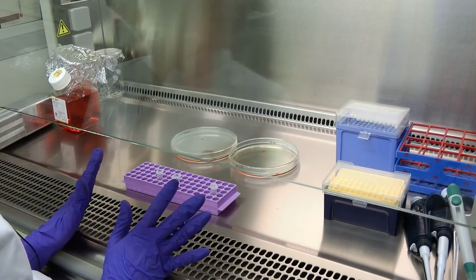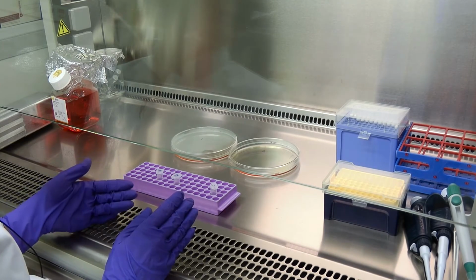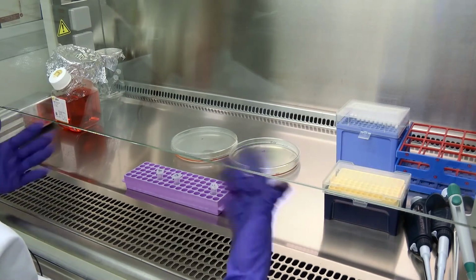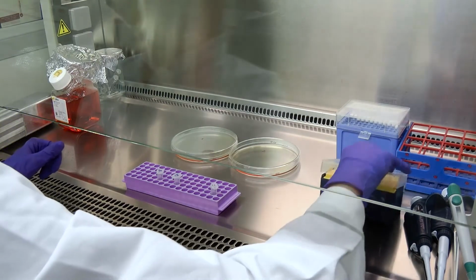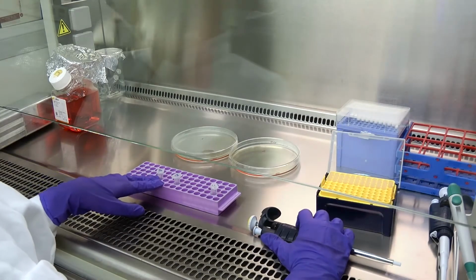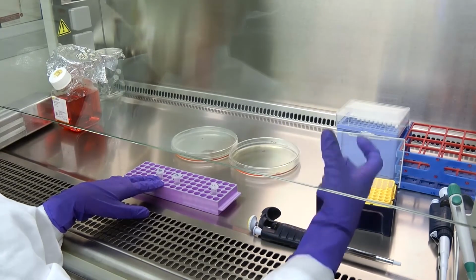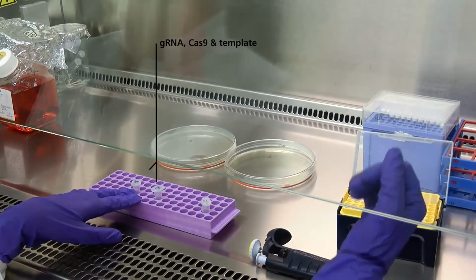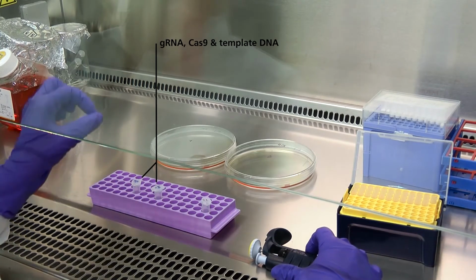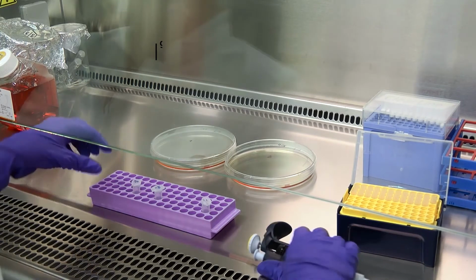Because we work with cells, we have to be working very carefully without contaminating them. Therefore, we're using a laminar hood. So the air comes from that side and it's filtered. What we are doing is, I have already prepared samples with our guide RNA, the template, and a Cas9 source, and we will tag genes that have cytoplasmic and nucleus localization.